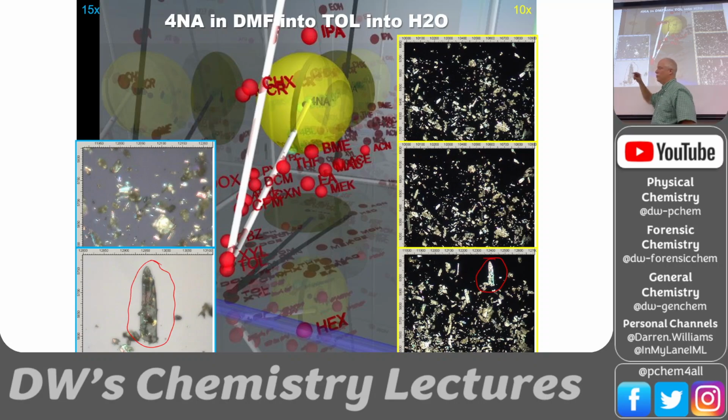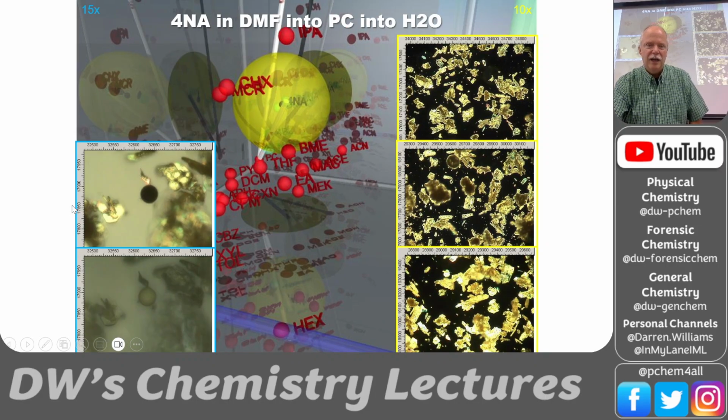This big old crystal grew on the side of the glass, and I remember seeing it. I was trying to wash it down, and so the glass surface stabilized that crystal and gave us a needle, as opposed to all the gravel. You see all of this other nasty stuff. And then into propylene carbonate, also gravel. So we see that the polar side with low dispersion is the best for growing some of these crystals.